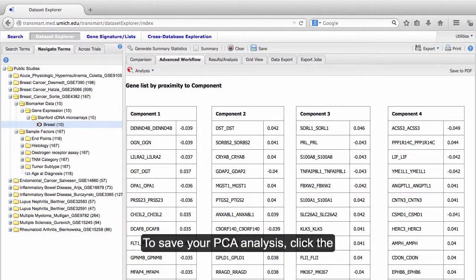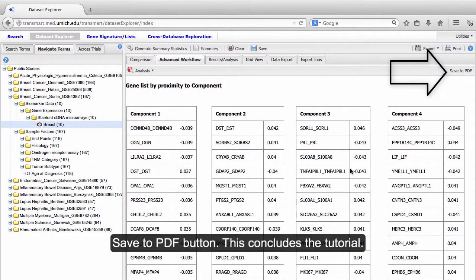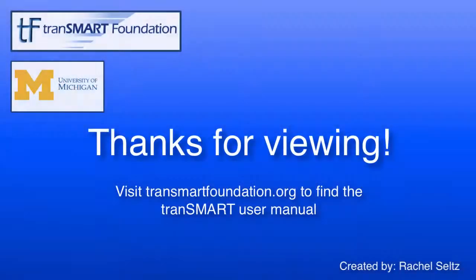To save your PCA analysis, click the Save to PDF button. This concludes the tutorial.